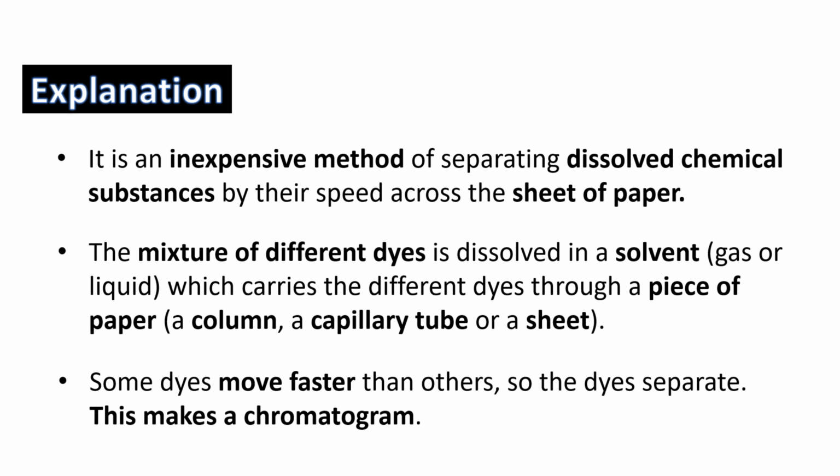Some dyes move faster than others because every color has its own rate to move across the solvent. So the dyes separate. This makes a chromatogram. In order to understand this phenomenon, we have to perform an experiment.